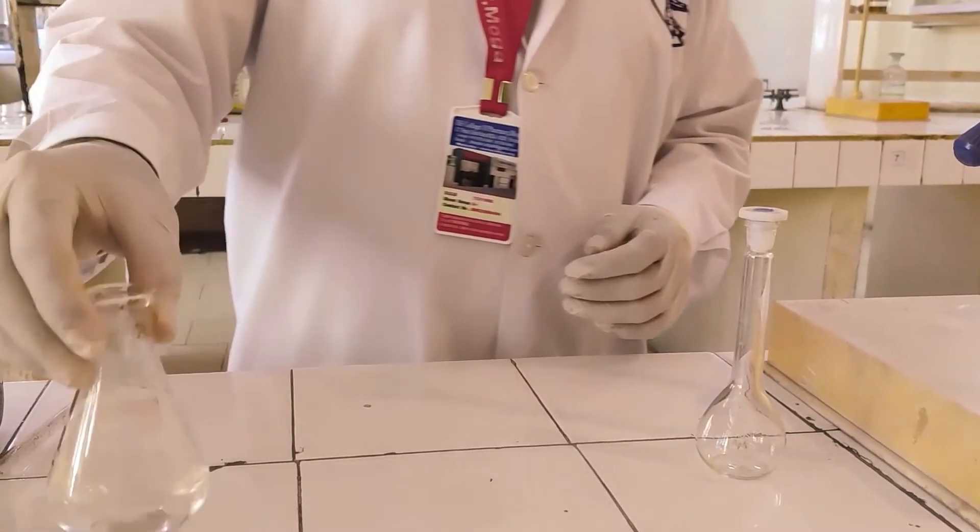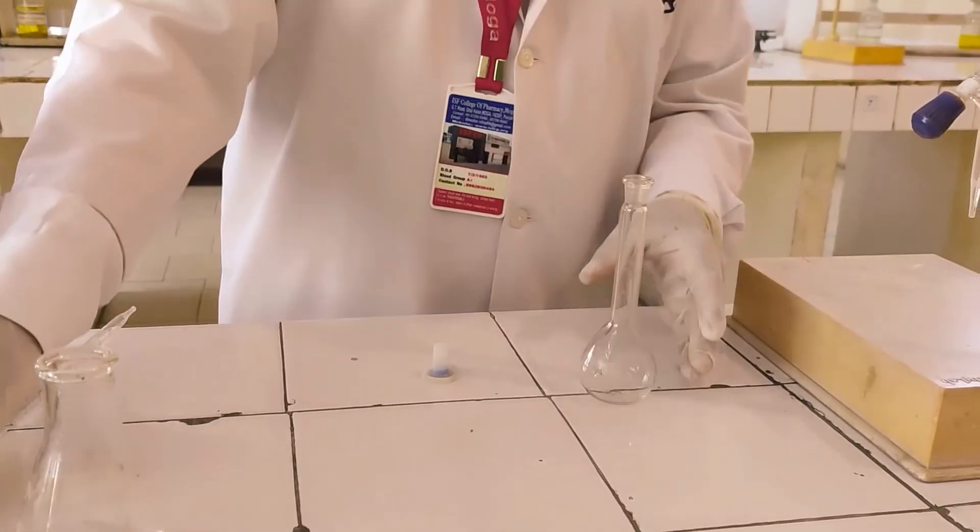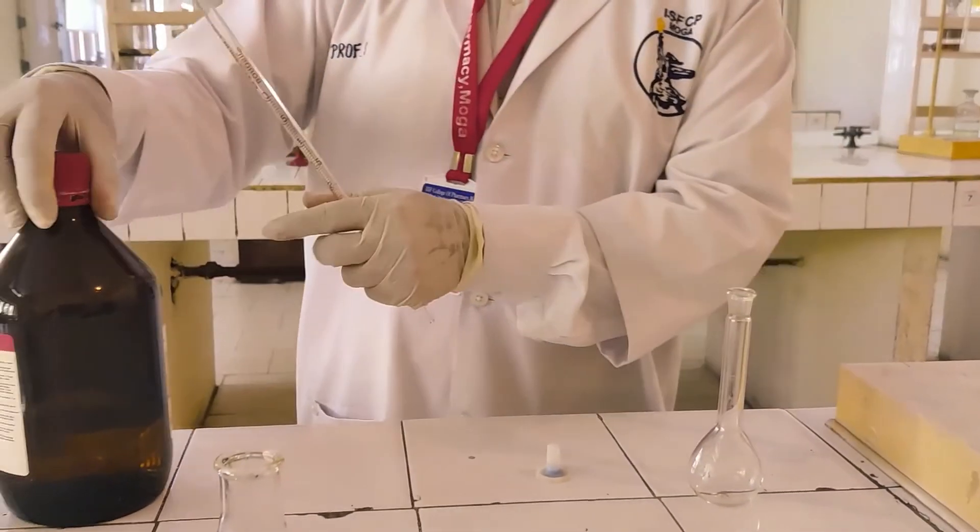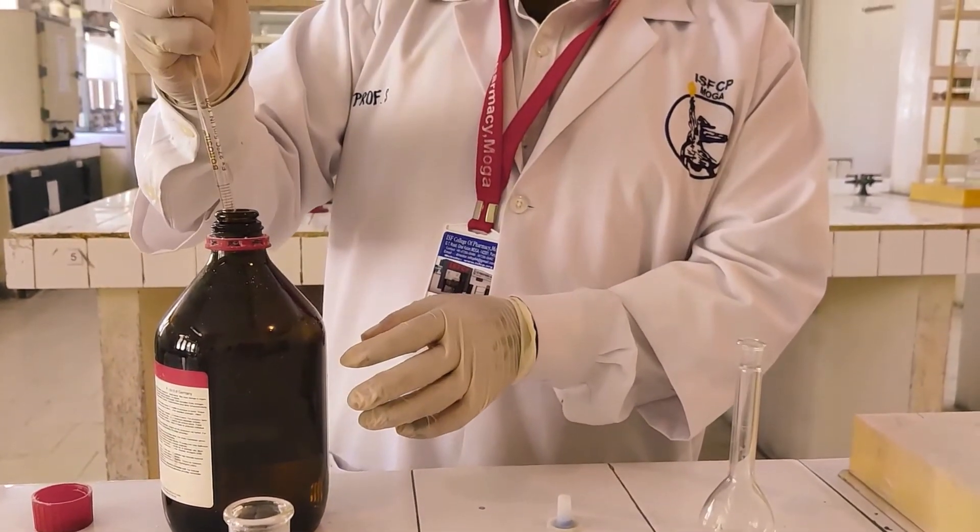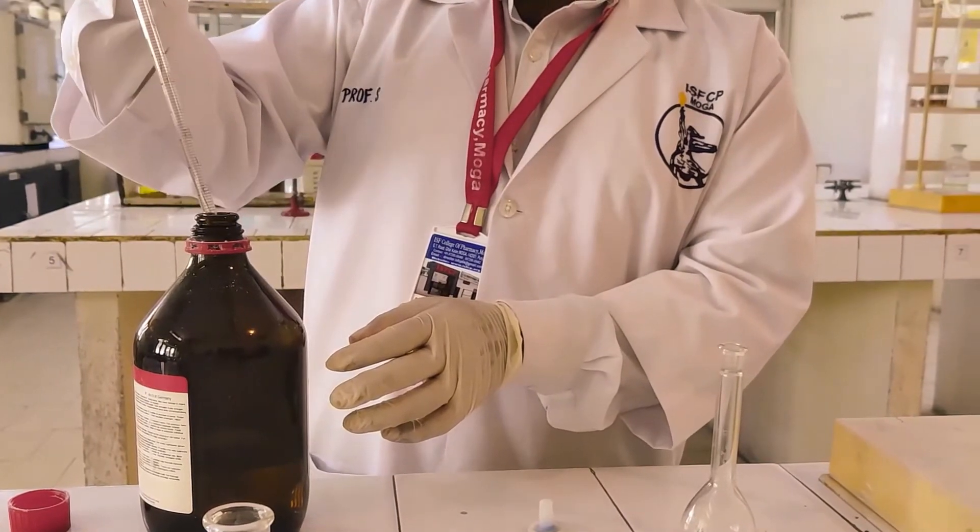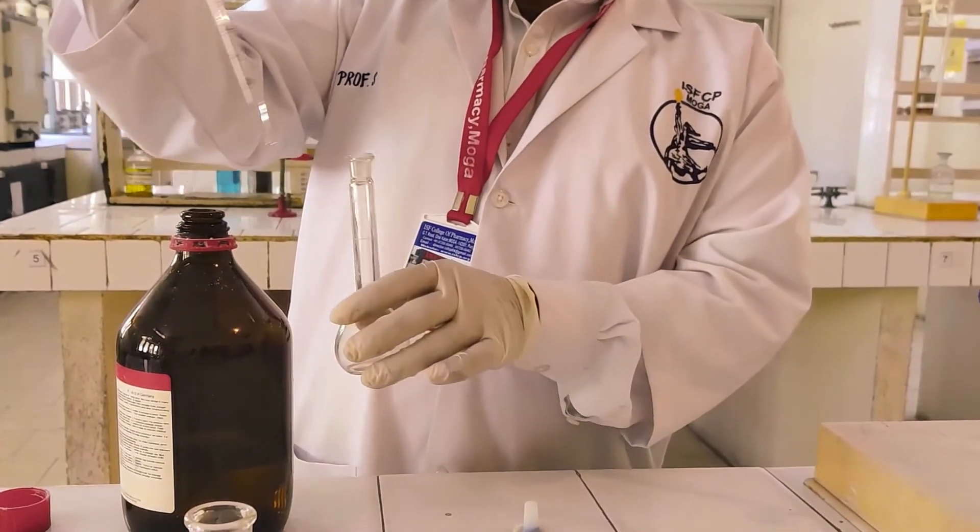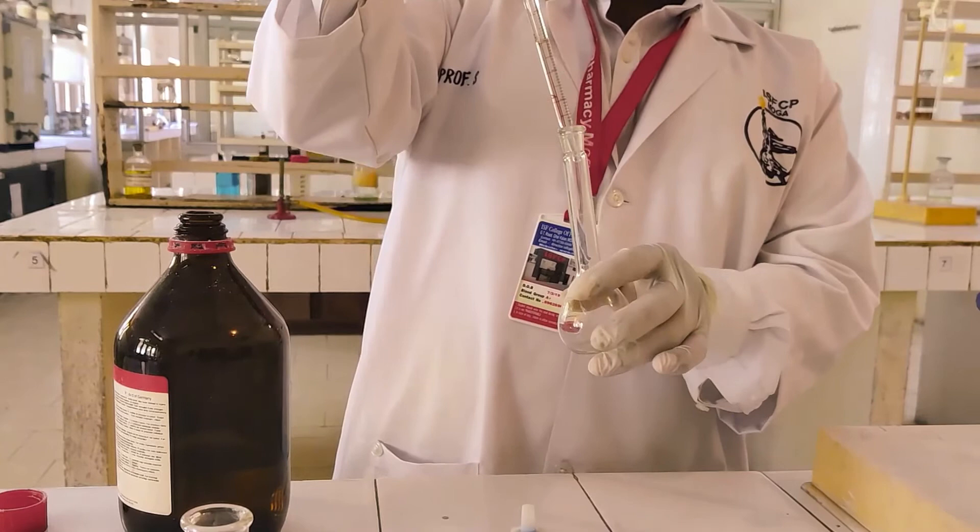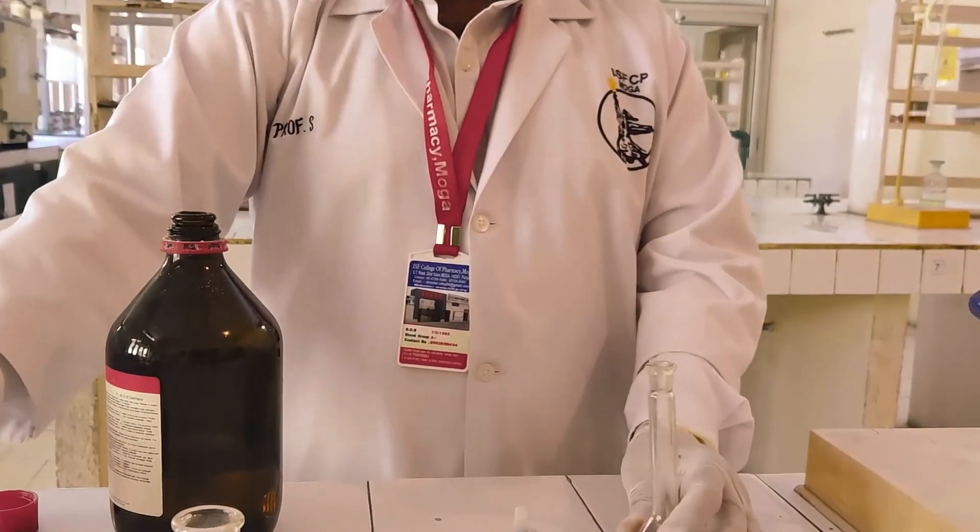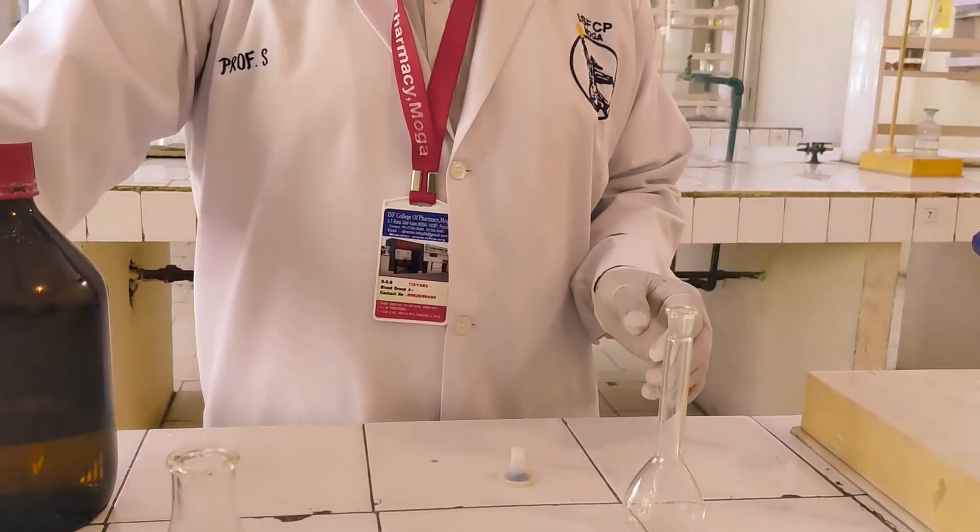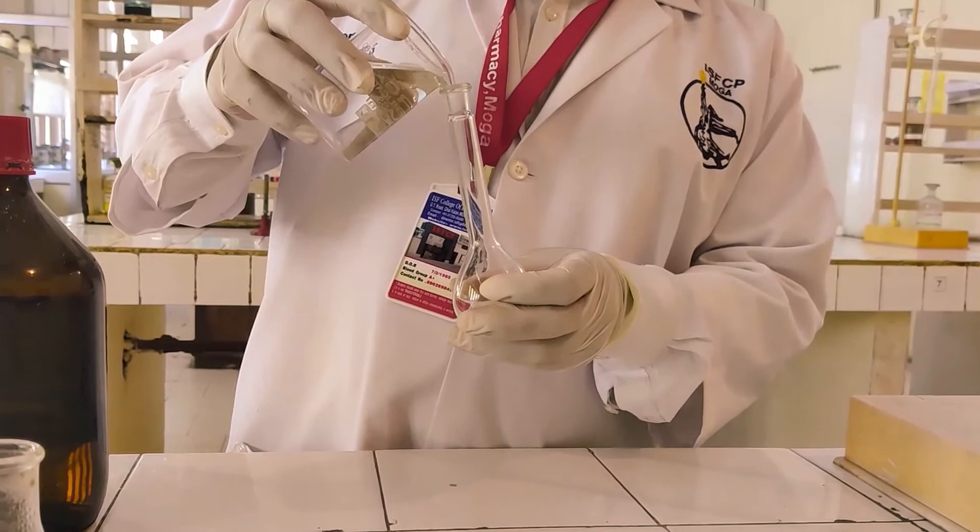Then gently boil it for 10 minutes on heating mantle. Keep aside this boiling solution to cool down. Meanwhile prepare 0.5 molar HCl. Take 2.2 ml of concentrated HCl.